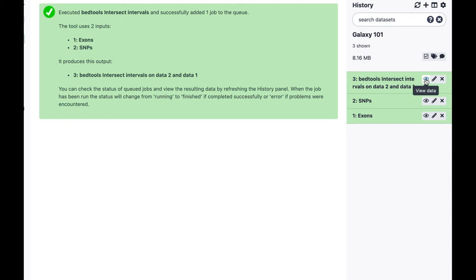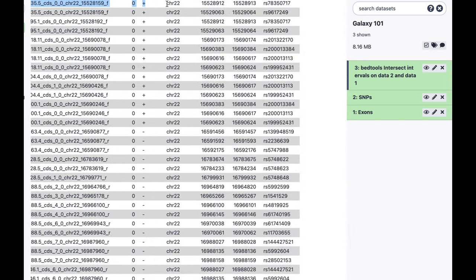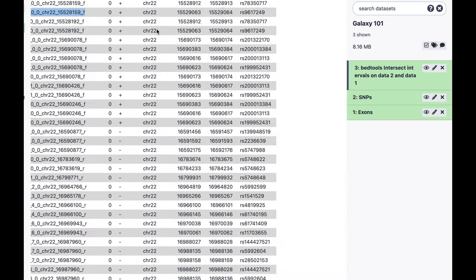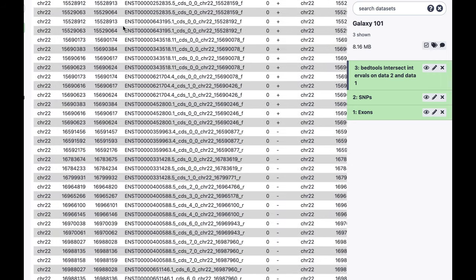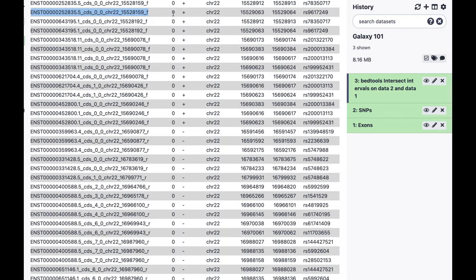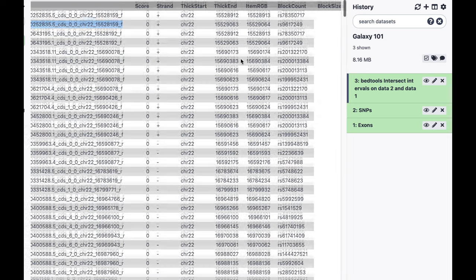Let's look at this dataset by clicking the eye icon. You can see the exon information with the snip information next to it. It's easy to see how many snips per exon we have — for example, the same exon ID appears with two different snips. We can count snips per exon by counting lines with unique exon IDs. The columns are: chromosome, start position, end position, exon ID, score field, strand, and for the snip: chromosome, start, end, and snip ID.